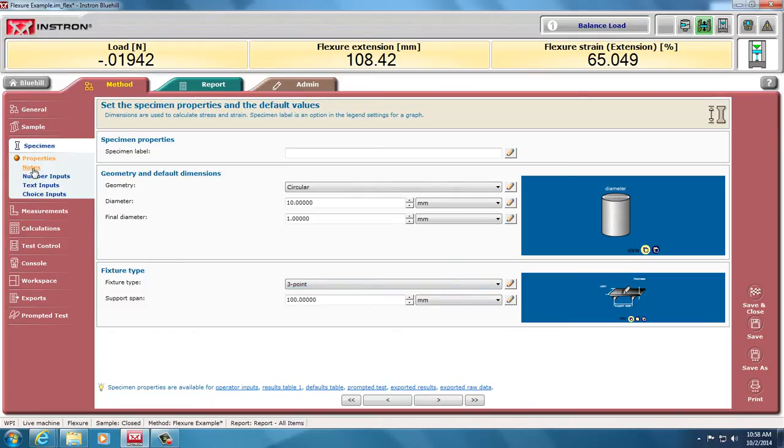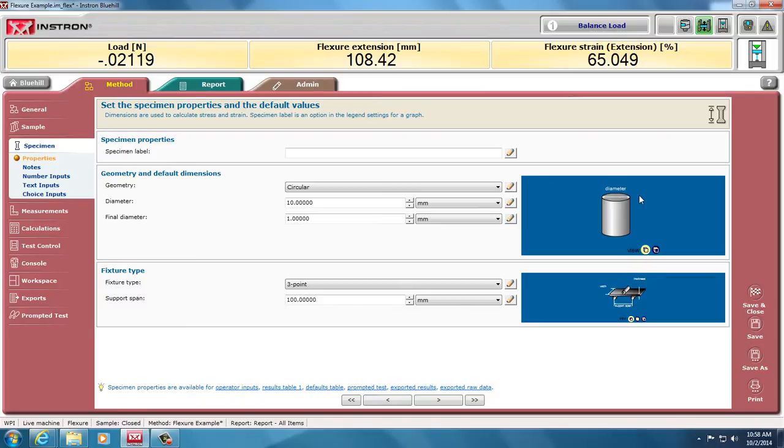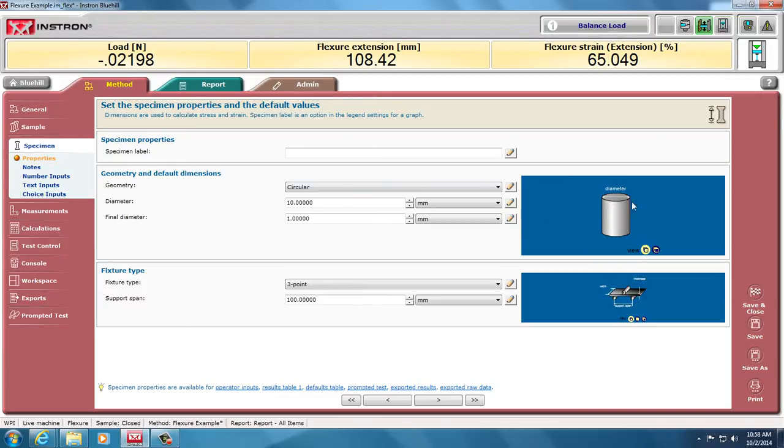You can add, as with other kinds of tests, notes, number inputs, text inputs. These are important here. The shape and the loading is important for the calculations that the INSTRON software will do for you. But as you notice here, this is a solid cylinder for something like a bone, where it's hollow in the center. You'll have to do your own calculations to figure out the stresses and strains and stiffness modulus of the material because it'll have a different moment of inertia.